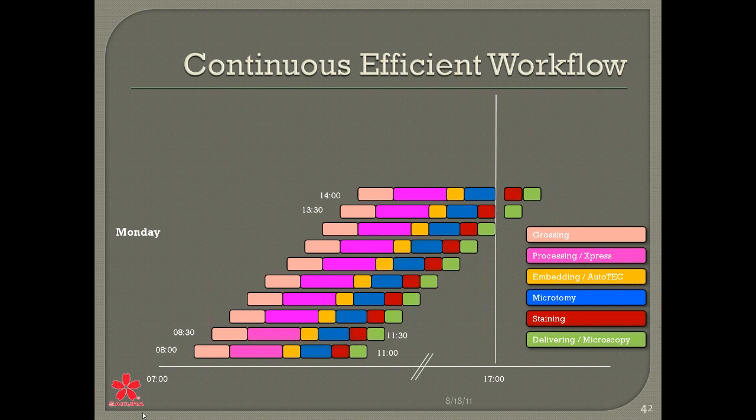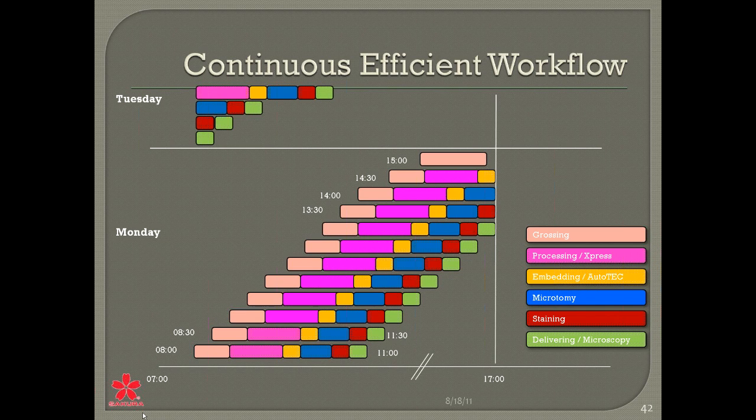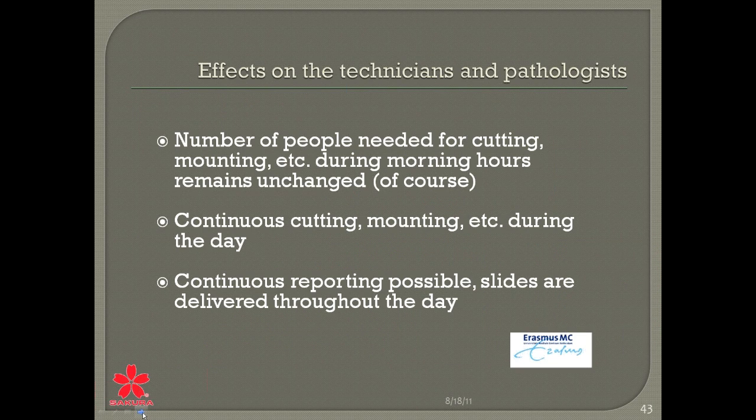At 2 o'clock, we are not able to stain it anymore, and so on and so on. And then we go to Tuesday morning, and then we can start the lab at 7 o'clock in the morning, just delivering already to the pathologist. And then we go on with staining and embedding, and the process is going on and on and on. And this is how we created our continuous workflow in the lab, and this is the one that really, really helped us out.